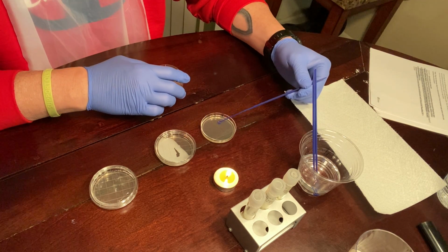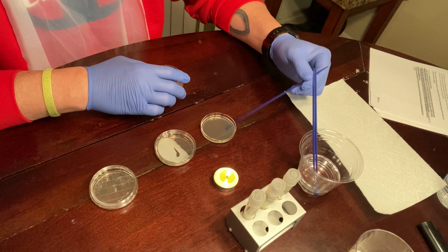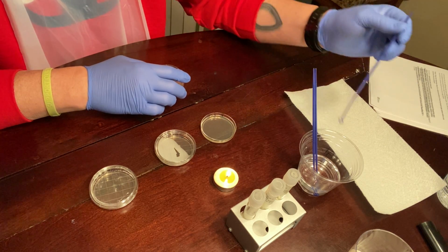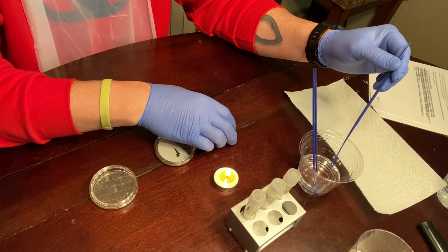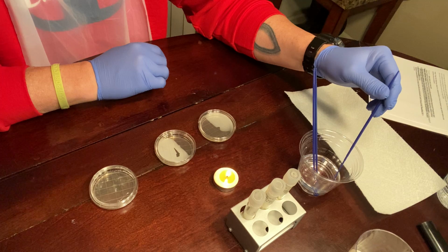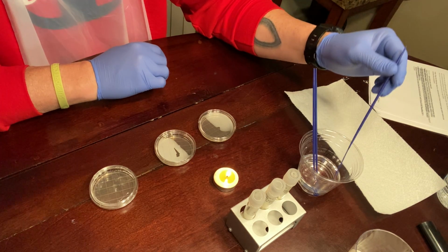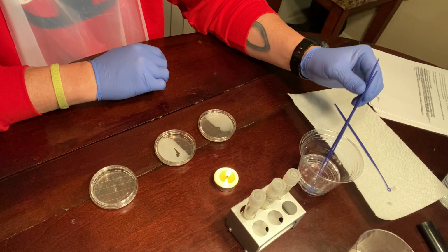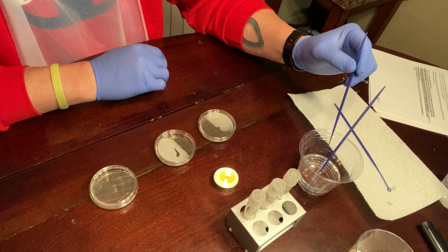I'm going to take it from the third quadrant to the fourth quadrant in a zigzag motion. And what I'm doing is just creating different colonies of the same bacteria. I'll set this aside, and I'm going to use a different one here.